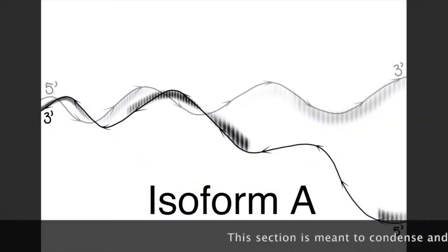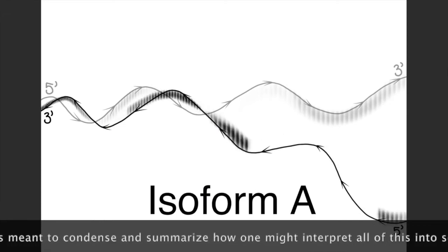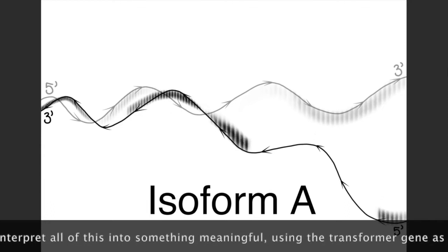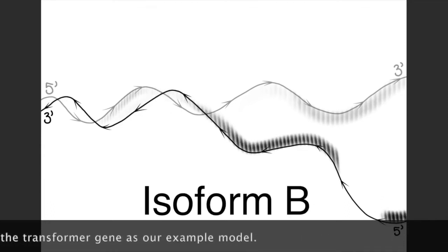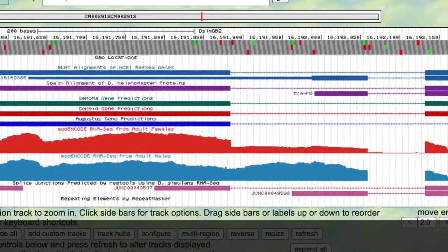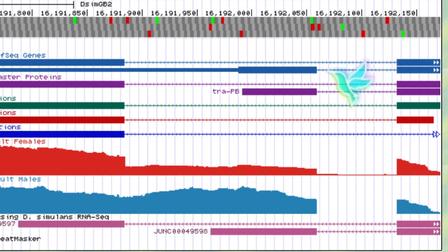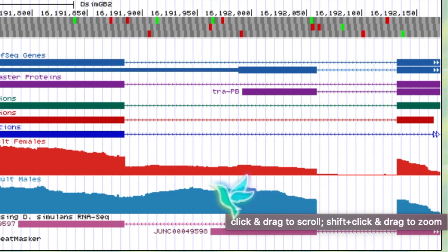The females use both splice-site acceptors to express both isoforms A and B. Meanwhile, the males only use one of those two possible splice-site acceptors, which is how we get isoform B. This alternative splicing leaves the impression of two distinct relative levels of expression, as seen in the RNA-seq track for our transformer gene.